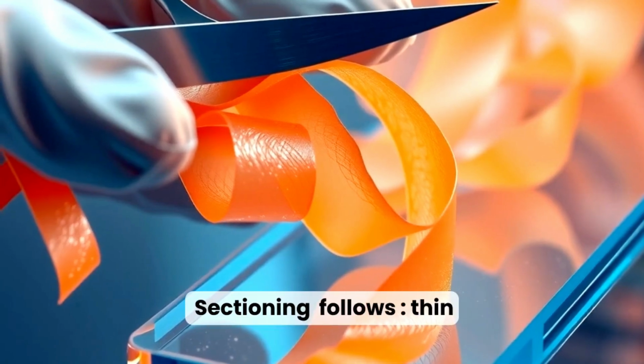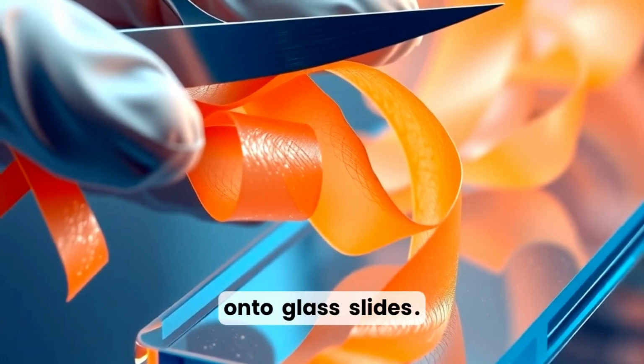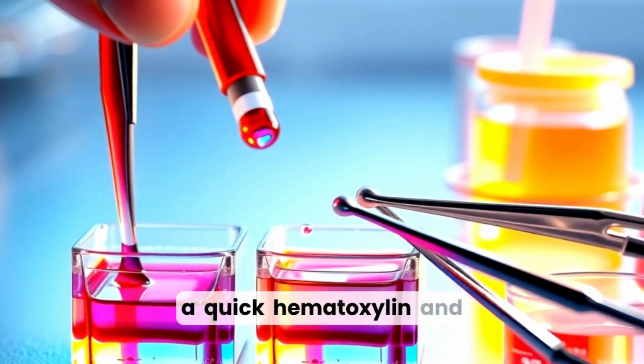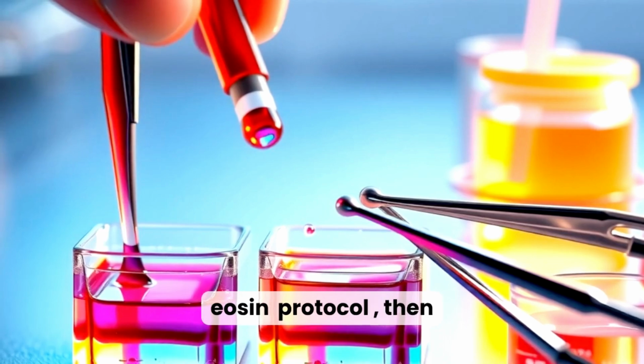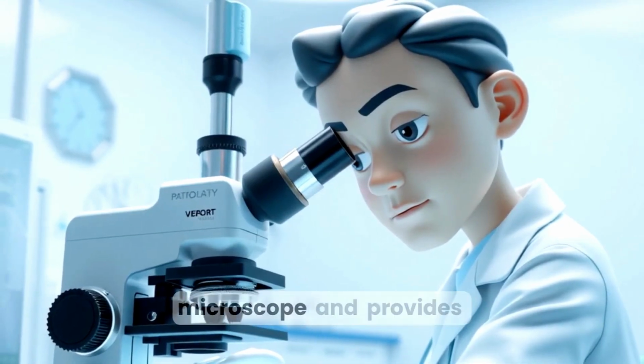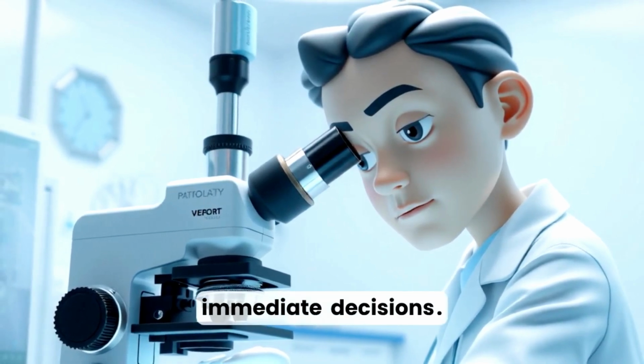Sectioning follows. Thin slices are cut with the microtome blade and transferred carefully onto glass slides. Slides are rapidly stained, typically with a quick hematoxylin and eosin protocol, then coverslipped for viewing. The pathologist examines the slide under the microscope and provides a concise report to the surgical team for immediate decisions.